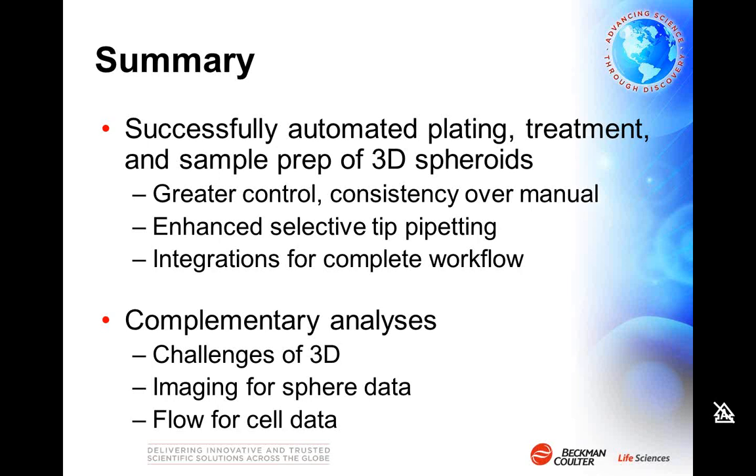And I was able to show how integrations can certainly help you automate complete workflows, whether that's through integrating incubators or analyzers, etc. And finally, I hopefully showed you how there are certainly challenges for analyzing the cells in 3D, but how you can complement high-content imaging with flow cytometry. Sometimes you'll get different answers, but they're answers you wouldn't necessarily get using just one or the other, and imaging can be valuable for getting sphere-wide data, while flow cytometry can be very valuable for getting cell-specific data.